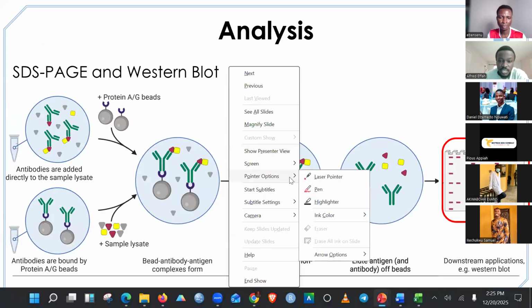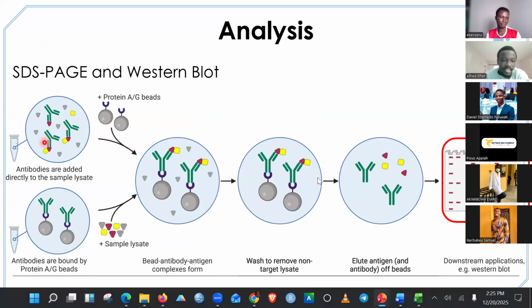So here, this is protein X, this is protein A. We can just use an antibody to detect X. We will say X is present, but it doesn't mean it is interacting with A. Do you understand? So if you want to find out if it's interacting with A, develop an antibody against A, then wash.